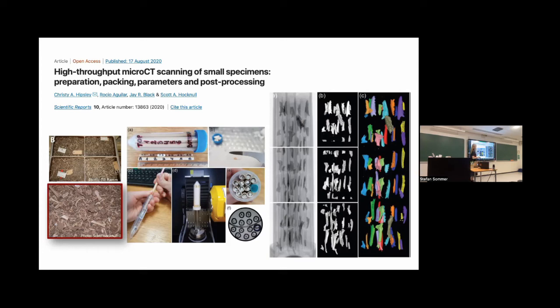And so we have come up with something almost embarrassingly simple, but you still have to pack these specimens in some systematic way where you can then go back and identify who is who, and link them to their own data, where they came from, and so on. And then we of course want to analyze those using things like morphometrics, where automated or semi-automated approaches are just necessary, because like Nikolai said, you don't want to just be clicking on these thousands and thousands of specimens.